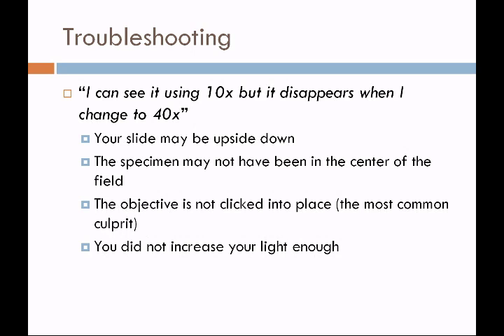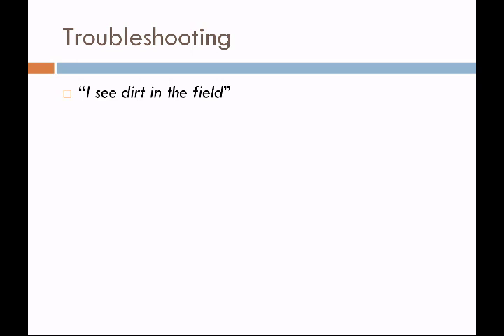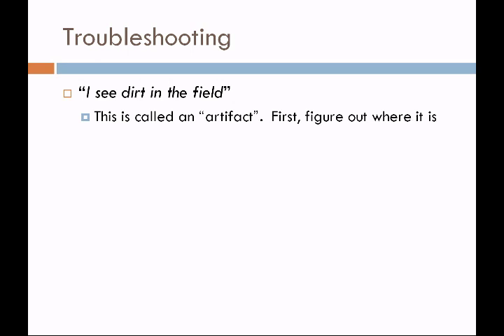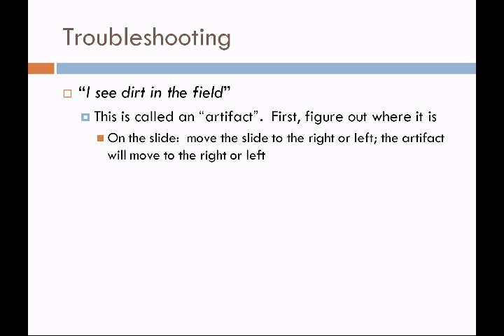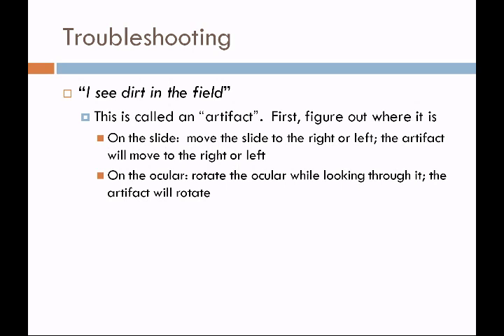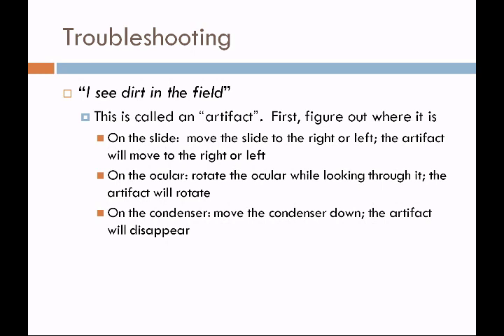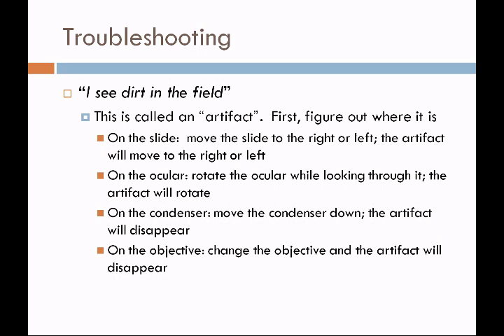If you don't increase your light, you're going to have difficulty with resolution. Another problem: I see dirt in the field, or I don't know if this is dirt or a microorganism. If it is dirt — we call these artifacts — you have to decide where the artifact is. If it's on the slide, move the slide and the artifact will move with it. If the dirt is on the ocular, rotate the ocular and if the dirt spins around, it's on the ocular — clean it with lens paper. The dirt might be on the condenser: move the condenser down and if the artifact disappears, that's where it was. If changing the objective makes the artifact disappear, it was on the objective.